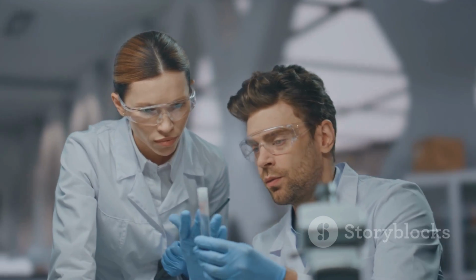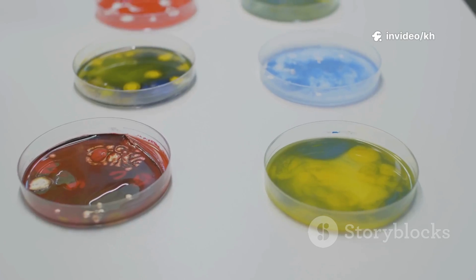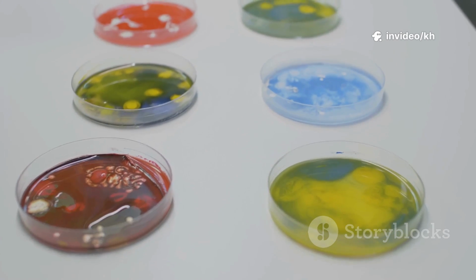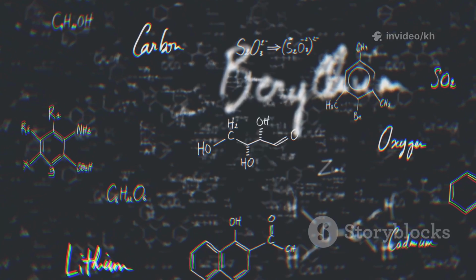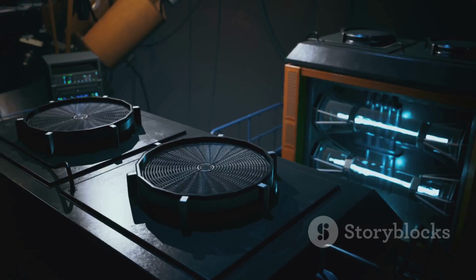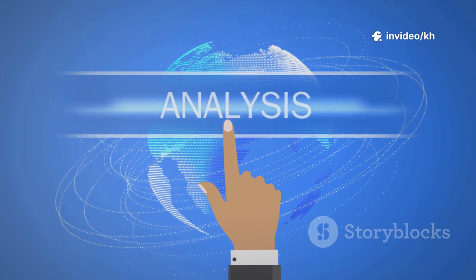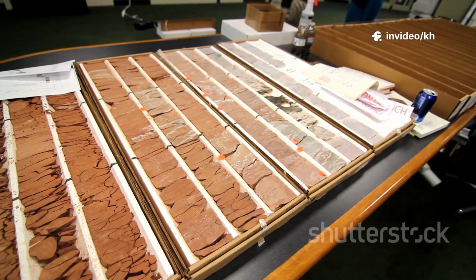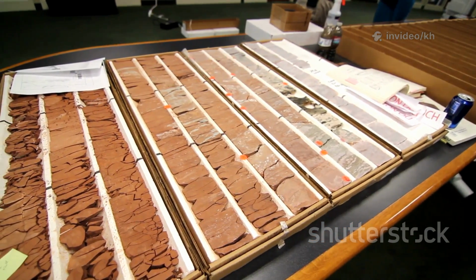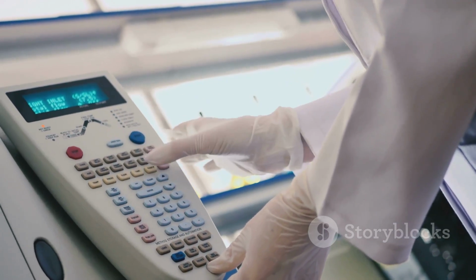Now, onto spectroscopy. Instead of just looking at materials, spectroscopy is more like listening to them. By shining light or other radiation on a sample, we can detect what elements or molecules are present. UV visible and infrared spectroscopy are common for organic compounds, while X-ray spectroscopy, like X-ray diffraction, shows us the atomic structure of crystals. Techniques like EDS and XPS give us precise details about a material's composition, often used in everything from geology to electronics.